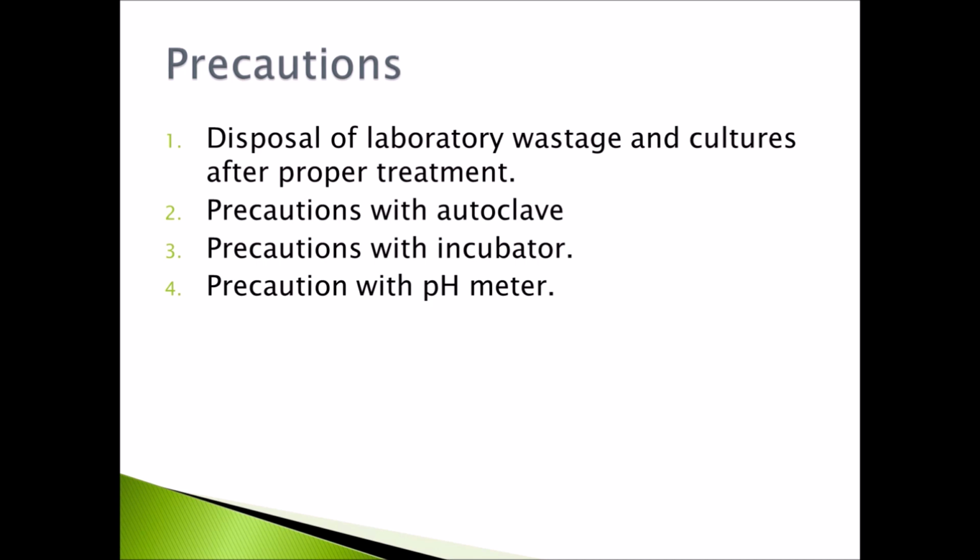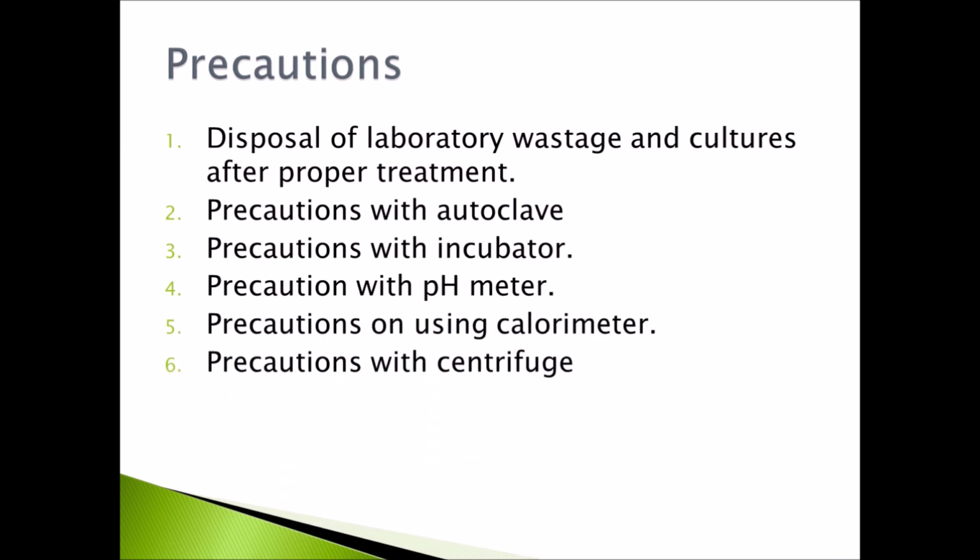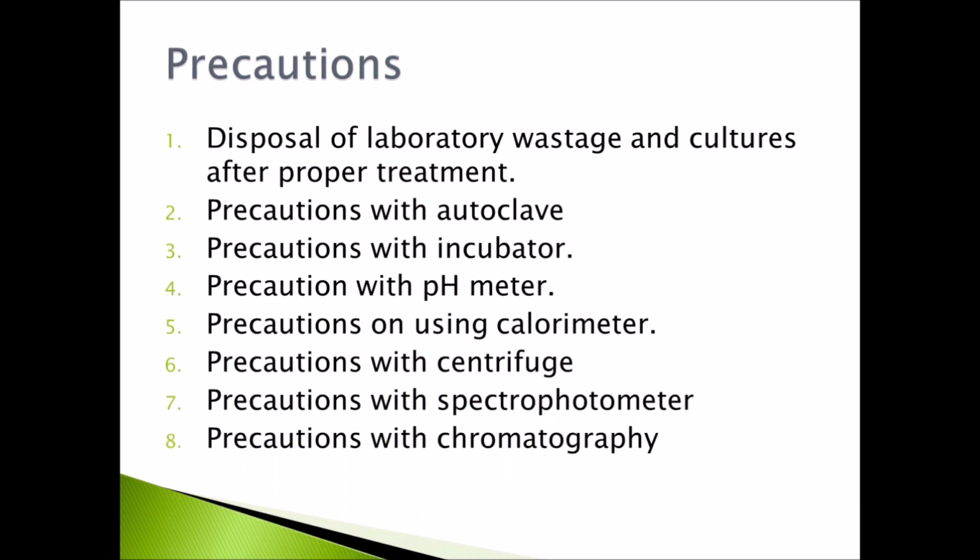In the laboratory, there are several other instruments, say for example, colorimetry, that is a colorimeter, centrifuge, a spectrophotometer, laminar airflow, respirometer, and so on and so forth. To discuss a few as regards precautions, I mention here a few.